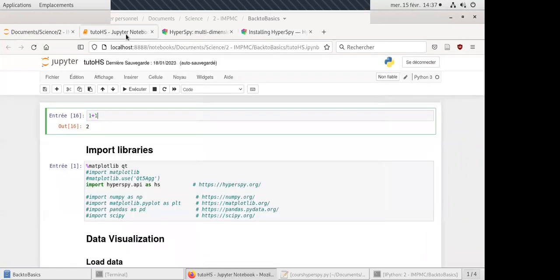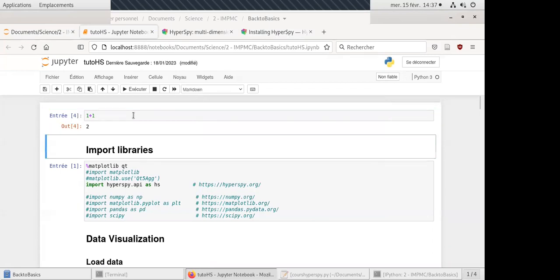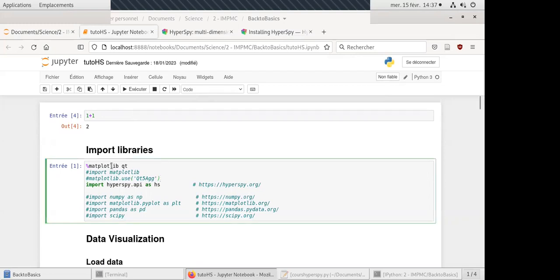Once installed, you have the Jupyter notebook, which opens in an internet browser. You can have blocks of code that you can run — either the whole code or just part of it. Here, to run just one cell, I have the output right away.